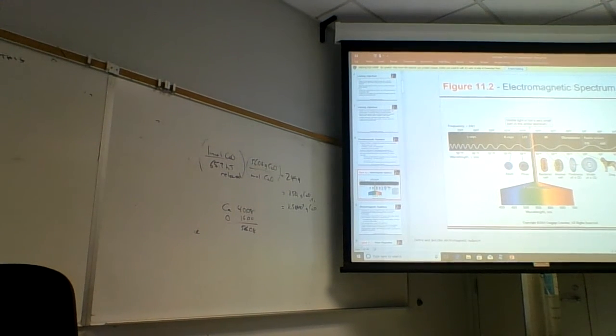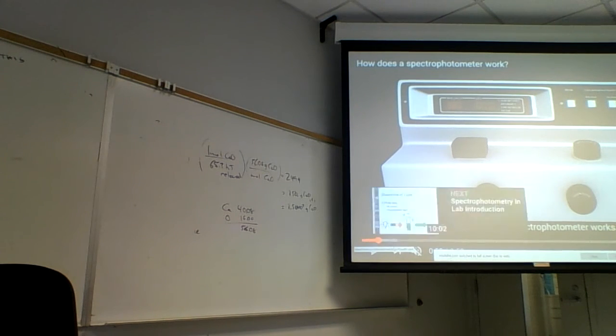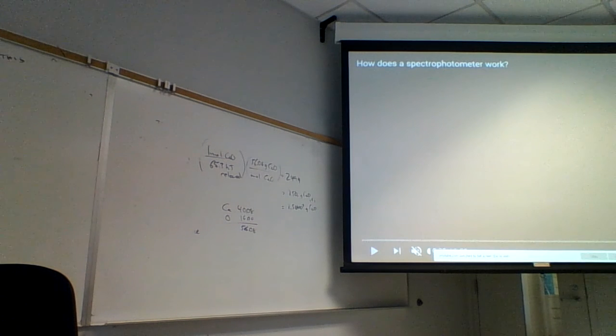So the study of light and matter, again, is spectroscopy. So we'll take a look at this. This is a simple spectrometer. This spectrometer is just shining visible light on the sample.